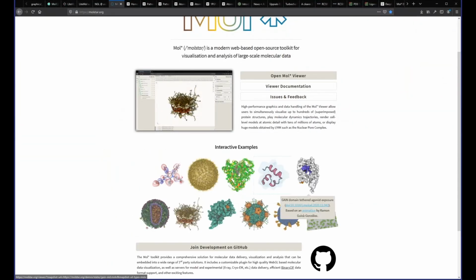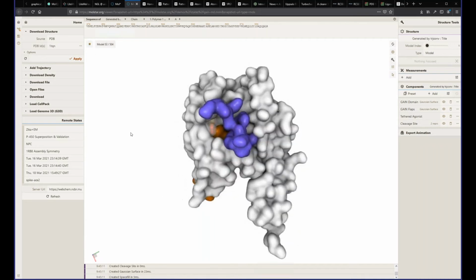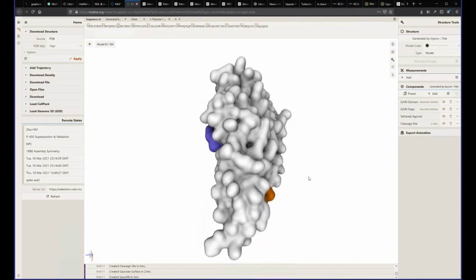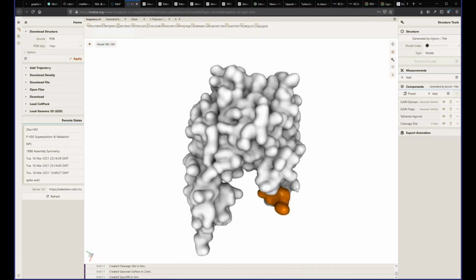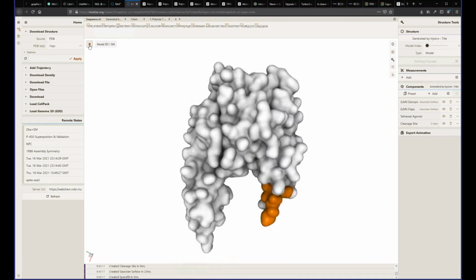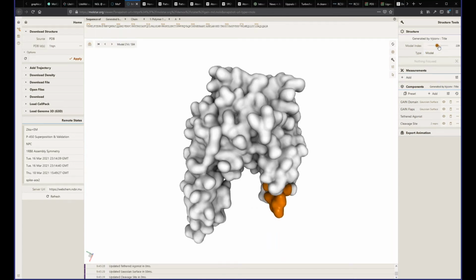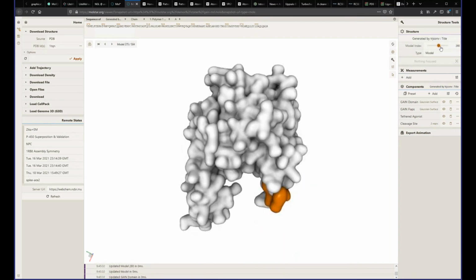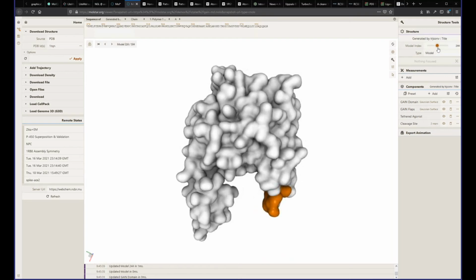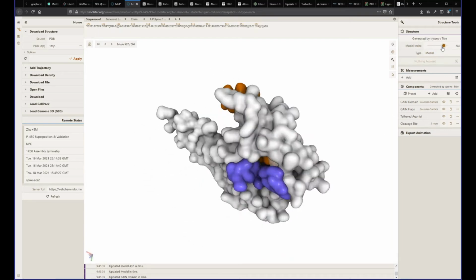Another example of this would be a bigger animation: 500 snapshots. And this surface is computed on the fly in real time on the GPU, and we can seek anywhere we want at any time and look at the entire simulation from different points of view.